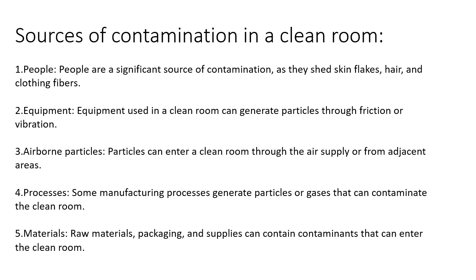So even though there are HEPA filters, it can happen that over a period of time, if HEPA filters are not cleaned properly, or there is a breakage in a HEPA filter, then particles can easily enter your clean room. Correct? So there is a proper schedule which is followed for checking your HEPA filters and validating them.